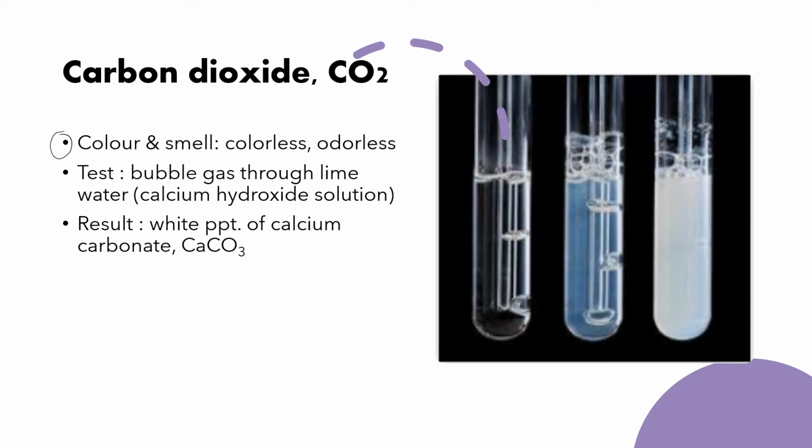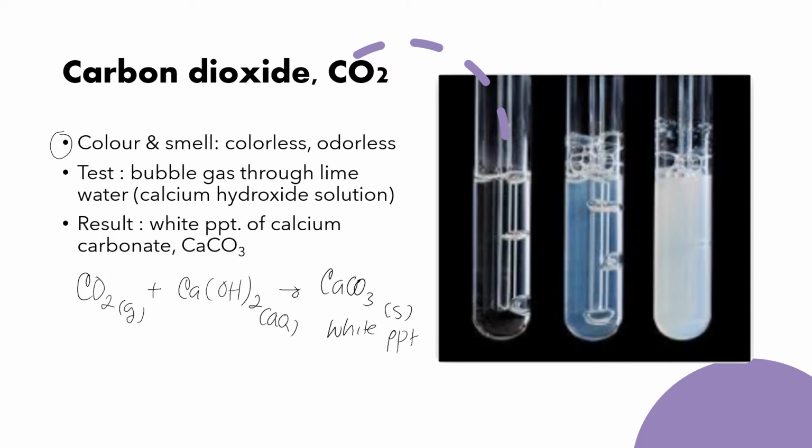The reaction between CO2 gas and calcium hydroxide produces CaCO3 solid, which is the white precipitate, and water. Here we have the CaCO3 solid or precipitate.